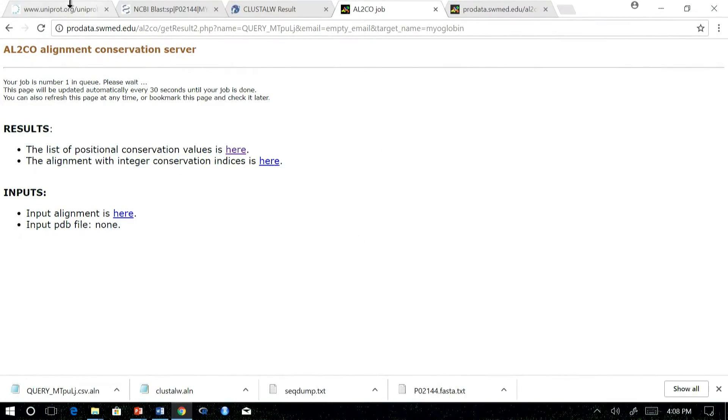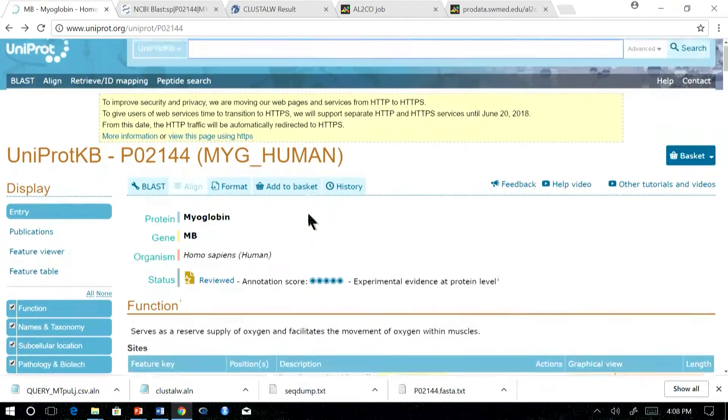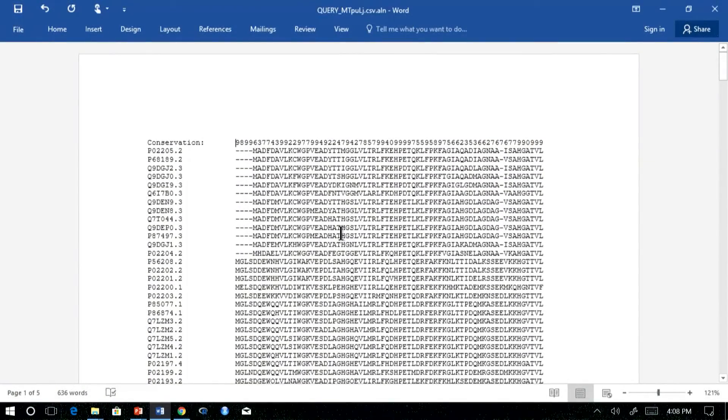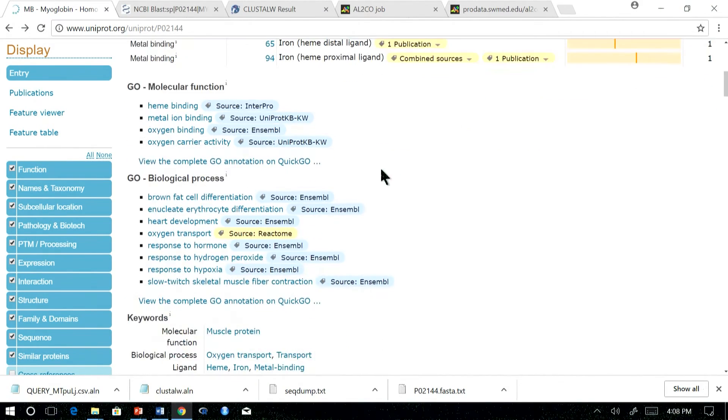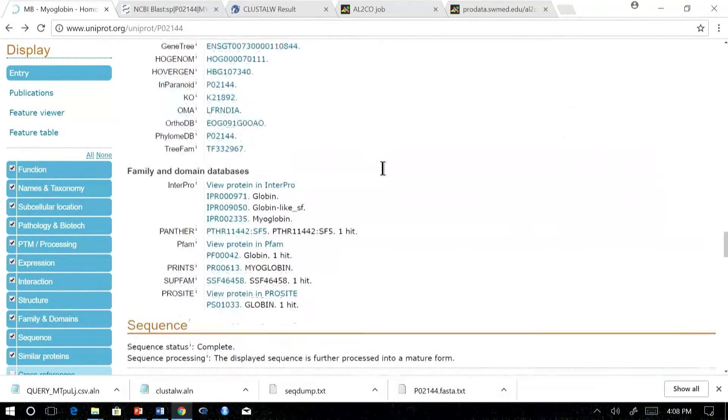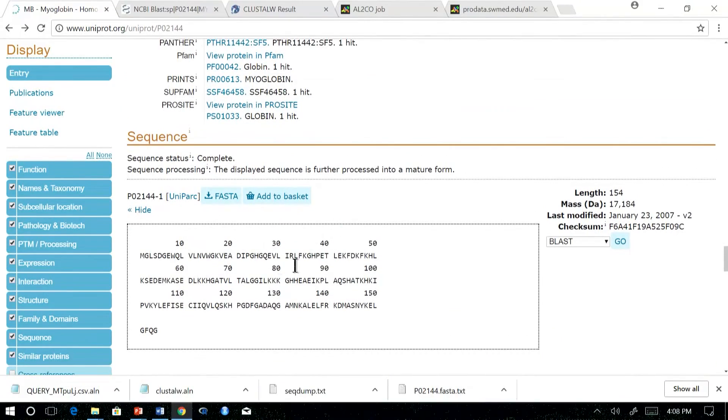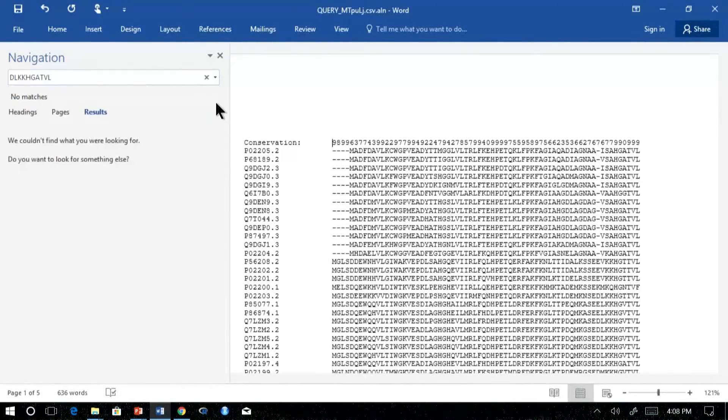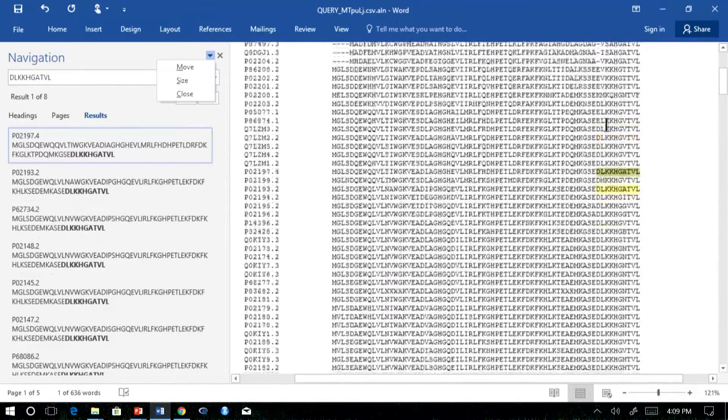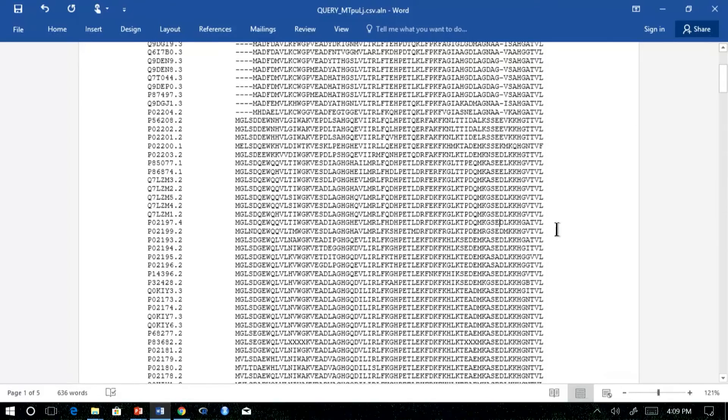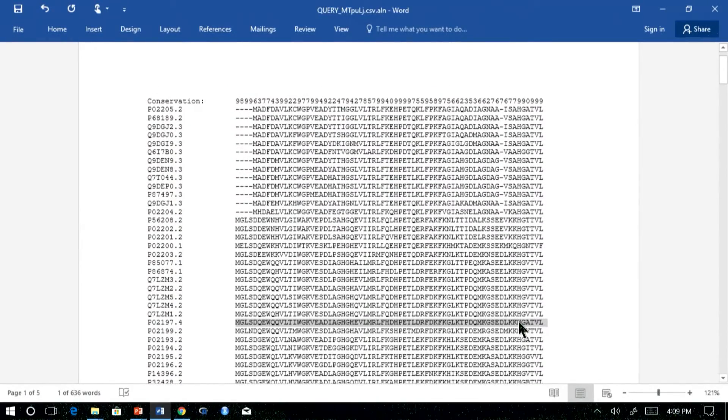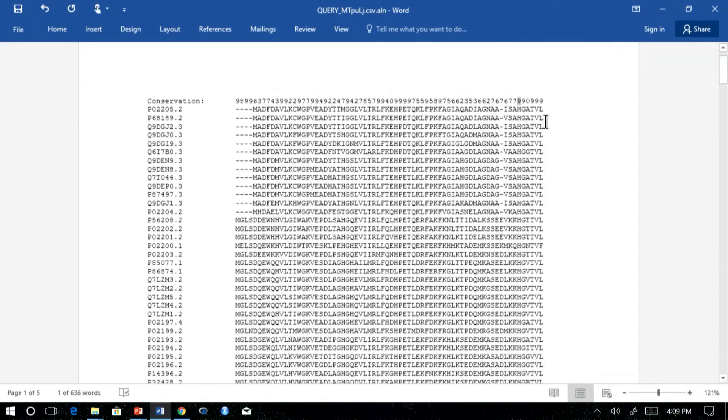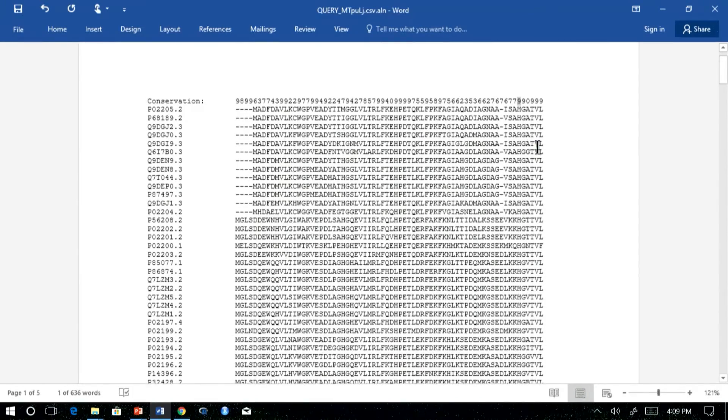It says 65 and 94 are metal binding regions, which are histidines. So it should be conserved across all the myoglobin proteins across species. So this is a region which is 65. If you could see that this position is conserved and has a conservation value of 9, as we could interpret.